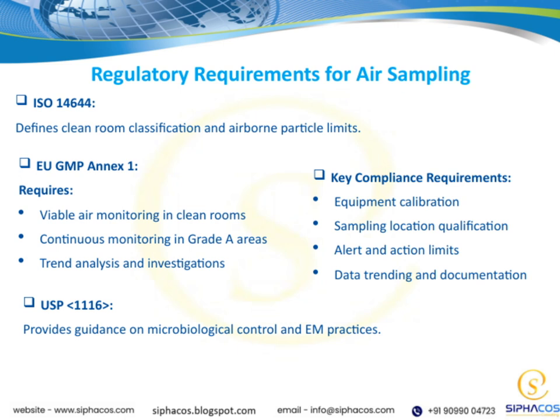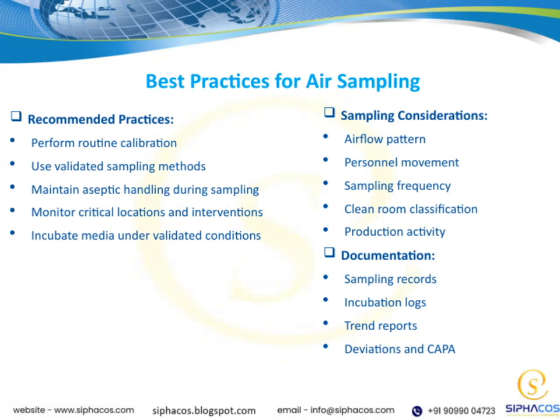They help us identify potential problems early and implement corrective actions before they impact product quality. All these points connect back to our overall goal: maintaining a controlled environment that ensures product safety and compliance. Let's dive into some important sampling considerations.